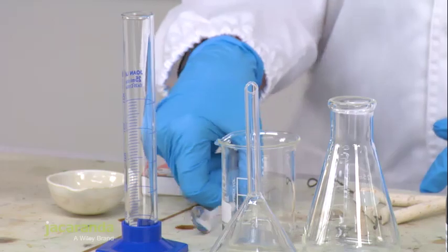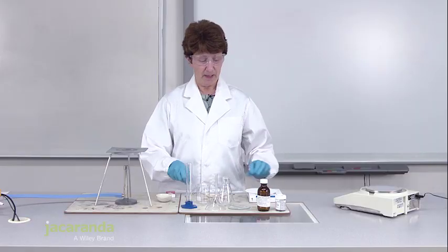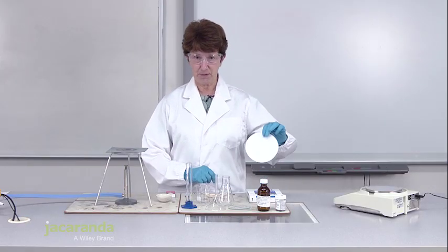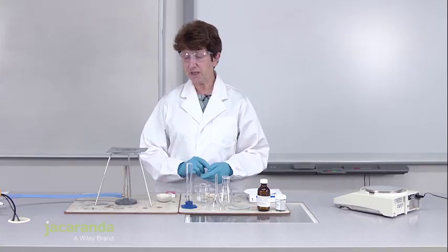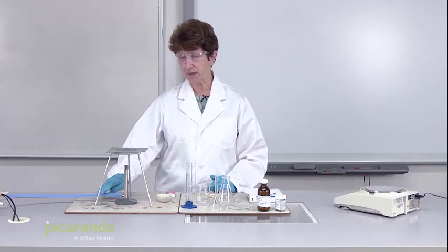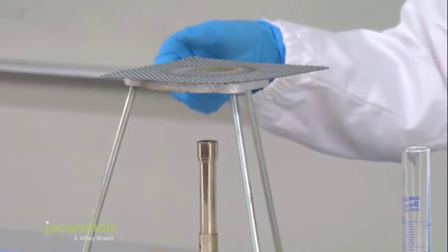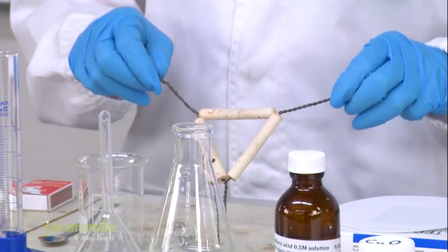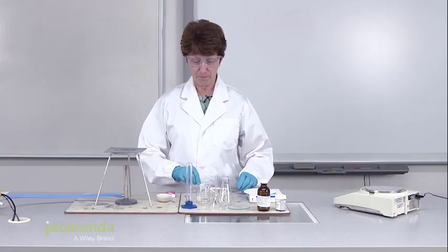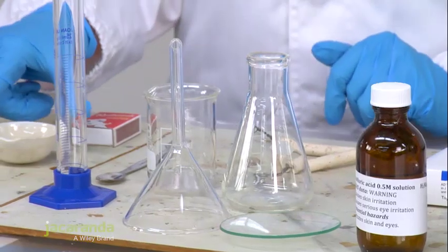We use a spatula to measure out copper oxide and a filter paper is needed for the filtering procedure. For the two stages of heating we need to have a tripod and a Bunsen. For the first stage we're going to use a wire gauze. For the second stage we're going to use a pipe clay triangle. We also have an evaporating dish.